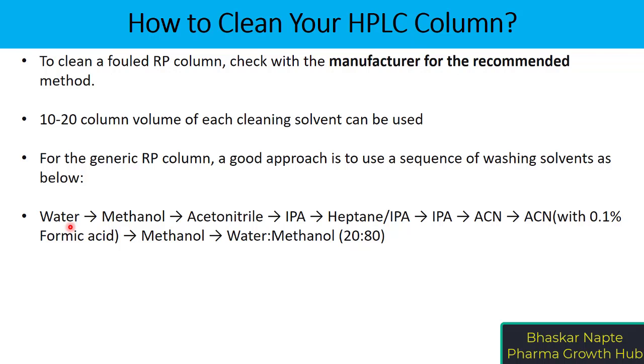Polar impurities can be removed with water, followed by methanol, then acetonitrile, then IPA. Heptane and IPA can be used in case there are highly retained non-polar impurities present in the column. Based on the nature of the sample, heptane can also be added.